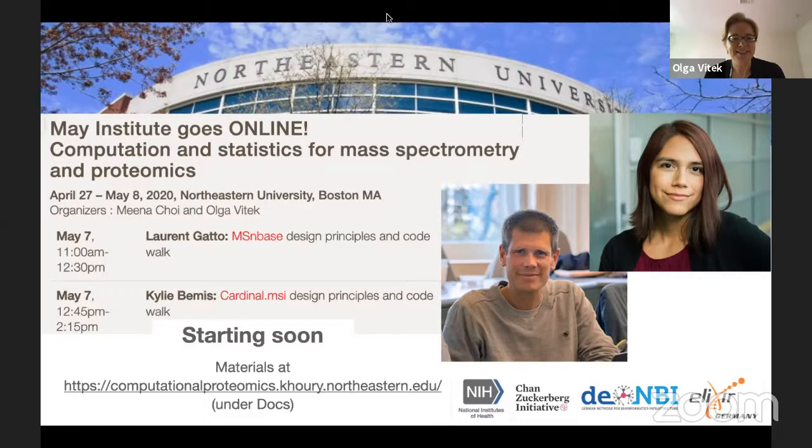So now let me welcome our second speaker for the session. Kylie Bemis is a statistician by training. She holds a PhD in statistics from Purdue University, and she is now a lecturer in the Khoury College of Computer Sciences at Northeastern University. Her research focuses on development of R-based tools and also statistical and machine learning methods for imaging mass spectrometry. And she has invested a lot of effort into working with imaging mass spectrometry data, which are, as we know, very large and require a lot of special design and special structure due to the spatial nature of the measurements. And so I'm very excited to have an opportunity to hear from Kylie today, and I hope you will enjoy the presentation. Thank you and welcome, Kylie.